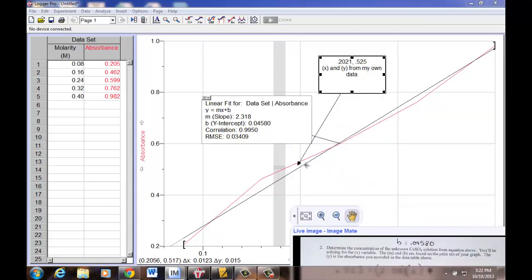So notice with number one, processing data number one, you're using the best straight line. Number three, you're going to use your actual line, the actual red line from your data mate here that will show you what your answer would be.